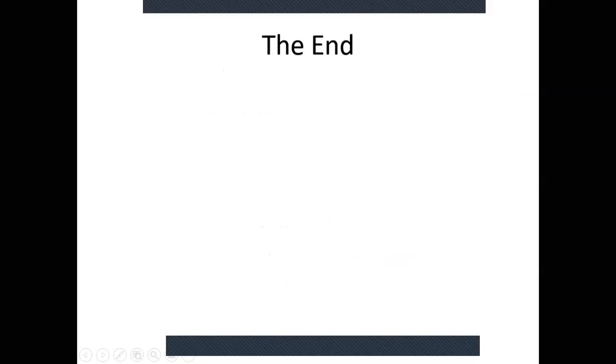So on that note, that concludes today's lecture on determining the concentration of phosphoric acid in sodas. Your alt experiment 10 uses Beer's law. It may not be sodas, but you do use Beer's law for an experiment.